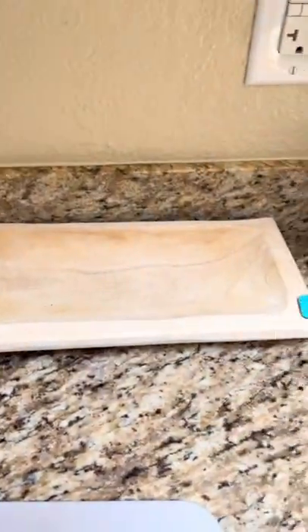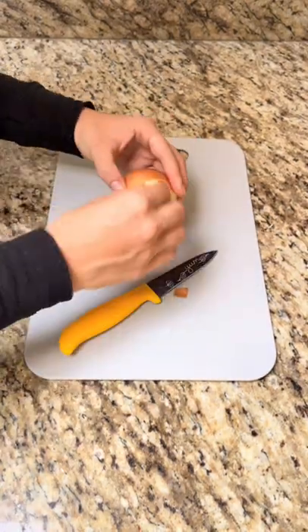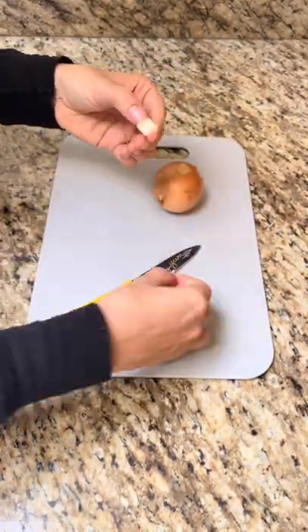Let's check out an onion underneath the Foldscope. To prepare your slide, you're just going to cut a little square out of the onion and pull that thin little layer off.